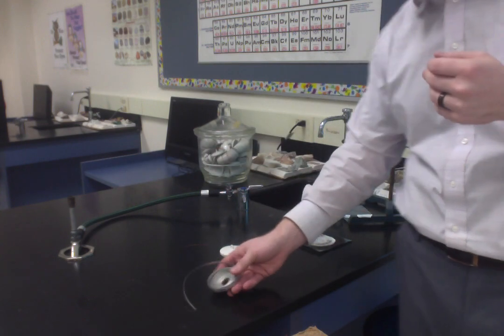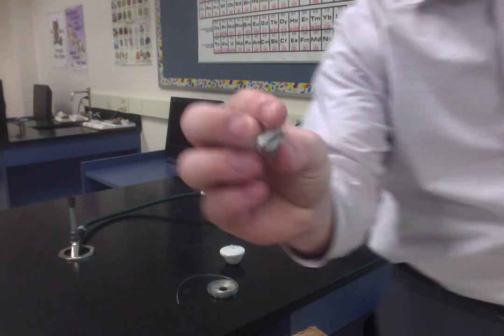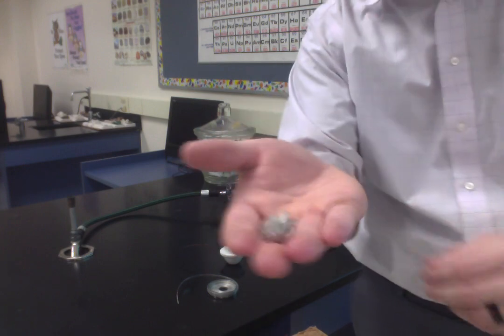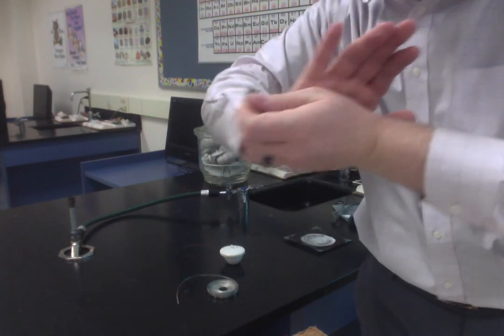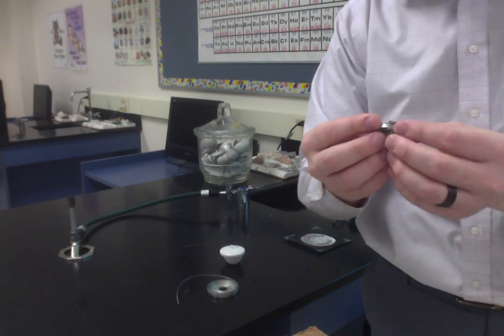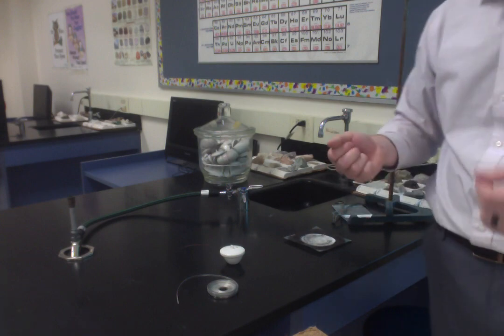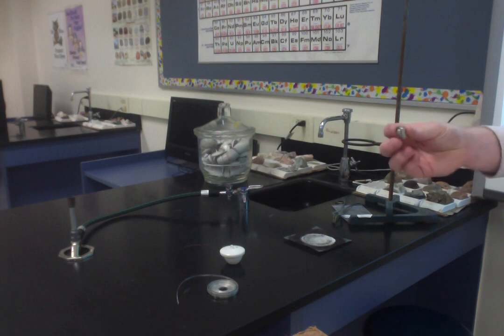So you're going to take your magnesium and you're going to curl it into a little ball here. As you can see, your strip's going to be about 20 centimeters long, and you want to bend it over like this so you have a ball with a little bit of air in the middle. You don't want to compress this thing until it's super crushed. You want a little bit of air there. And you're going to find the mass of this. And notice right off the bat, you're halfway done with the lab, because all you need to solve the lab is the mass of the magnesium and the mass of the oxygen that bonds with it.